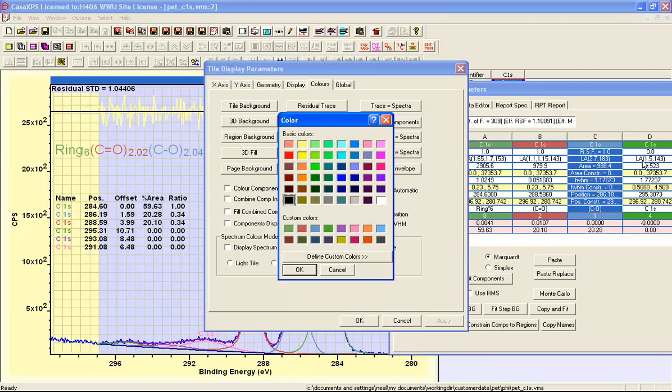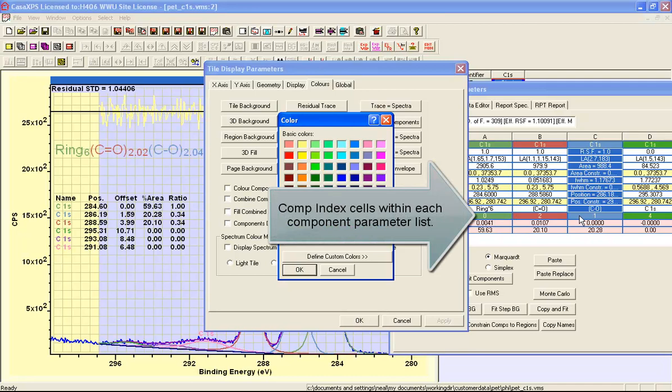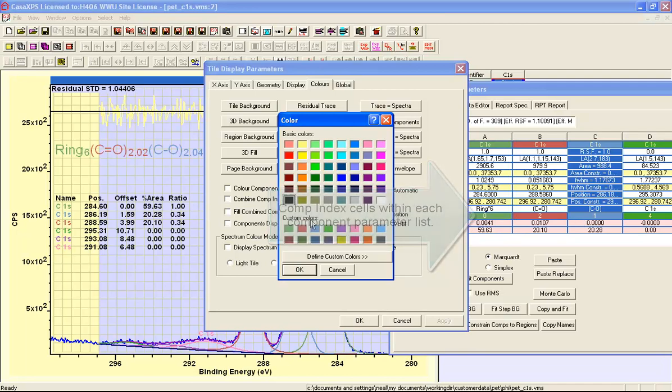However, the component index can be used to override this sequence. If you define different values for the component indices for each of these components you can assign a specific color from this palette.